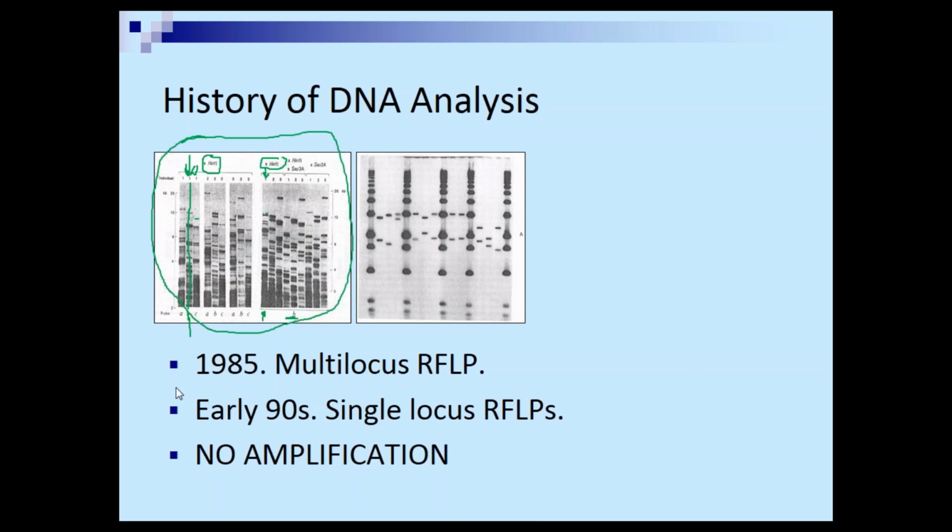All right. But the problem is that smear, when it was on a gel, you can't see DNA. So instead, what they would do is they would use a probe that bound to repetitive DNA, although that's not that important, and the probe would light up certain areas of DNA. So whenever you took my DNA, whether it was from a blood stain or DNA from my mouth or DNA from some other body fluids, if you extracted that DNA, smeared it out, and visualized it with a probe, it would always produce the same pattern. Hence the term DNA fingerprint, and it was specific to me.